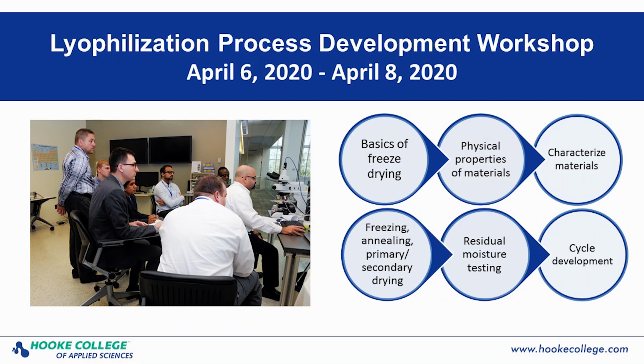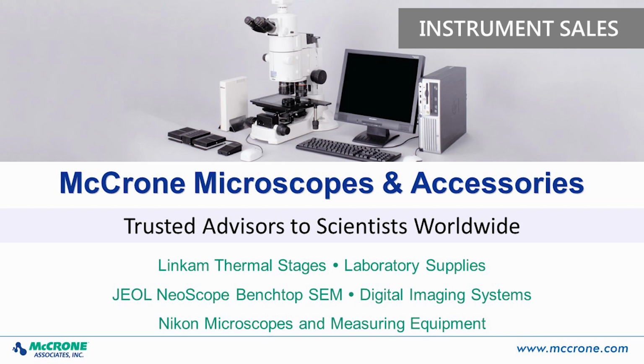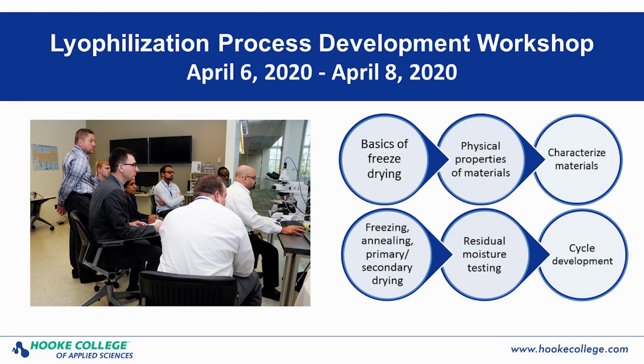Okay, thanks, Spencer. That was a great presentation. We're going to move into the question and answer part of the webinar now. And if you have any questions, please go ahead and type them into the questions field. Looks like our first question comes from Chris. Chris wants to know, in your optimization example, controlled nucleation was used in both optimization steps. How can someone optimize their freezing recipe without controlled nucleation?